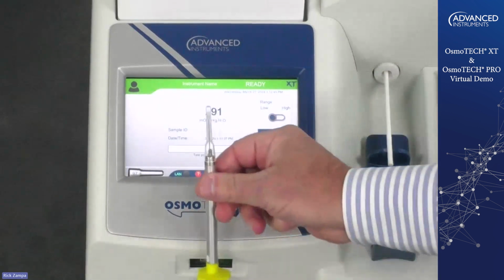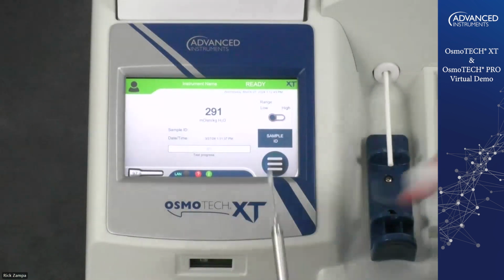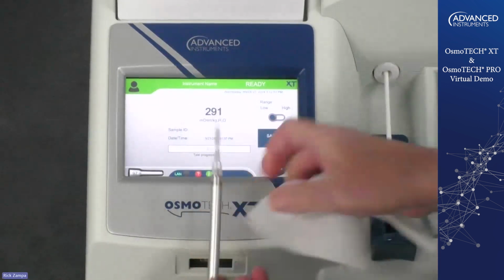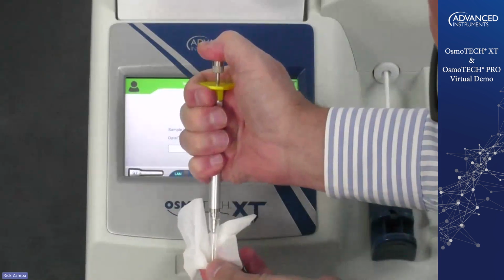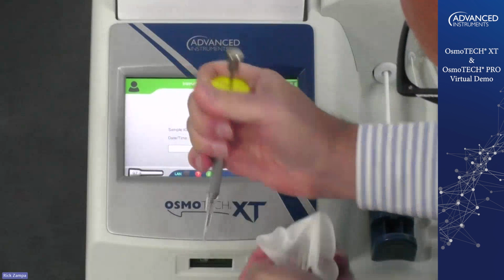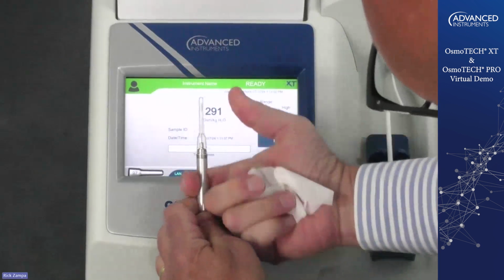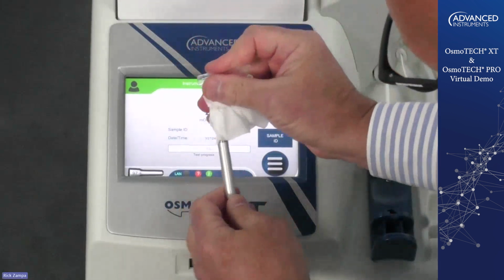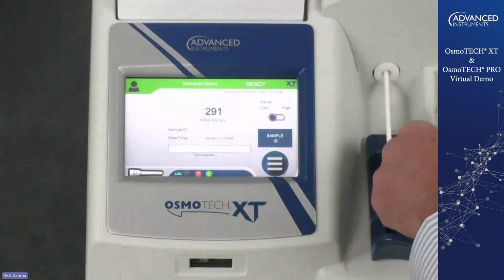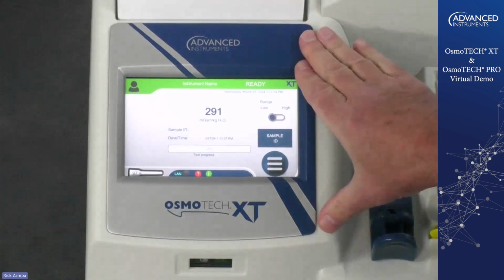Now, the next thing I want to do is remove the sample tip from the sampler. There are two ways to do this. You can push down on the plunger and you hear it snap out of place. Or I find it easier to do it a different way. I just take my thumb, give it a little push at the top, slide it off, wipe off the Teflon tip, put it back in the cradle, and you're ready to run your next test. So that's how to run the OsmoTECH XT.